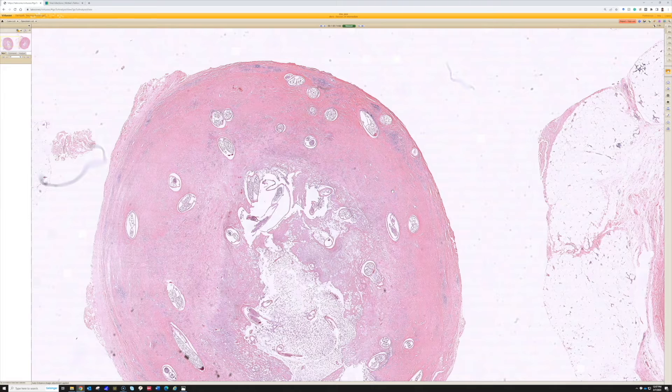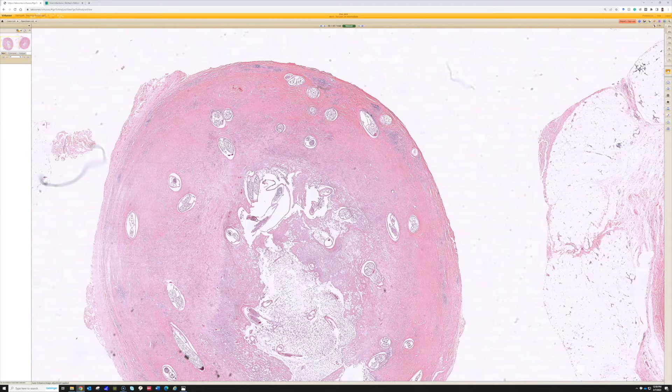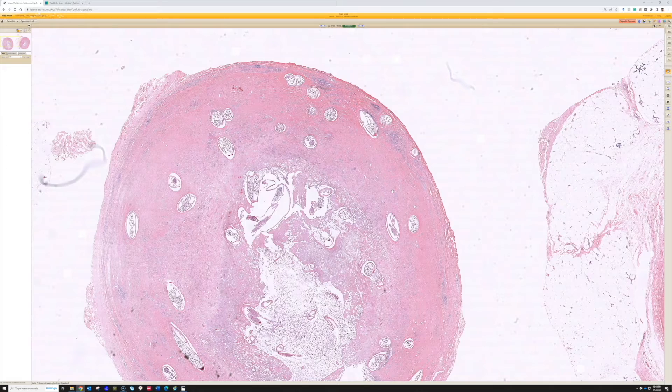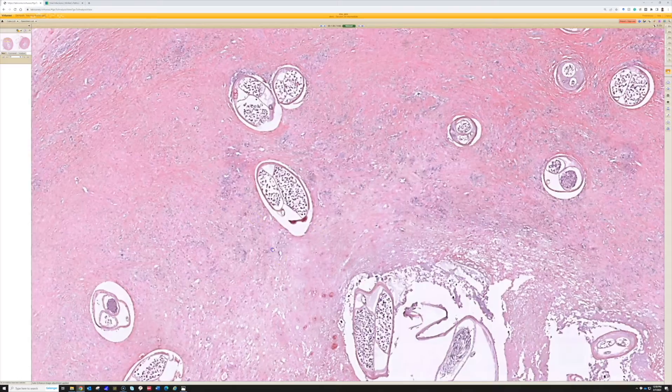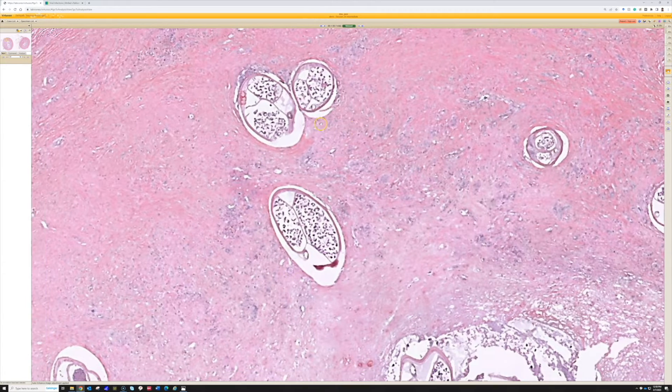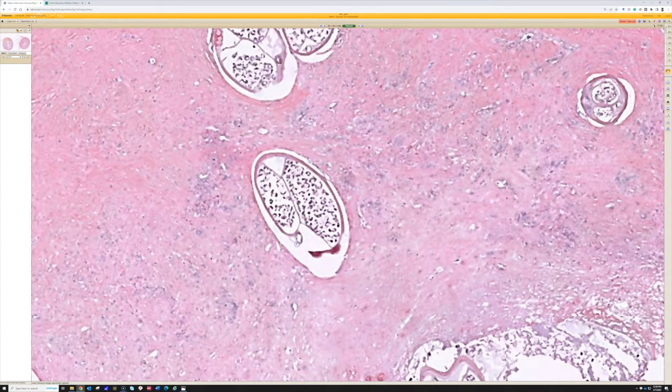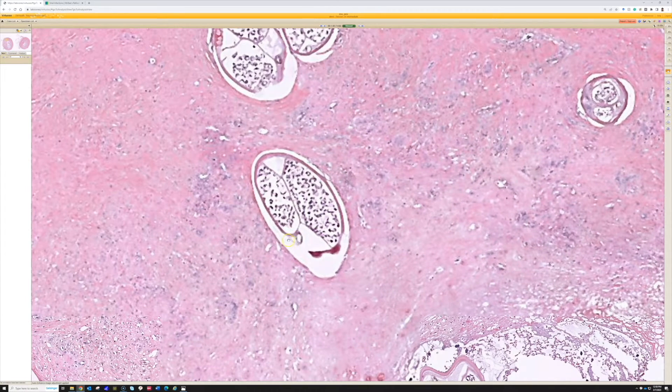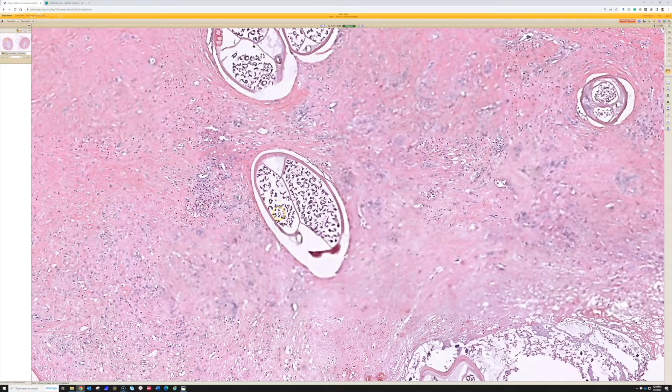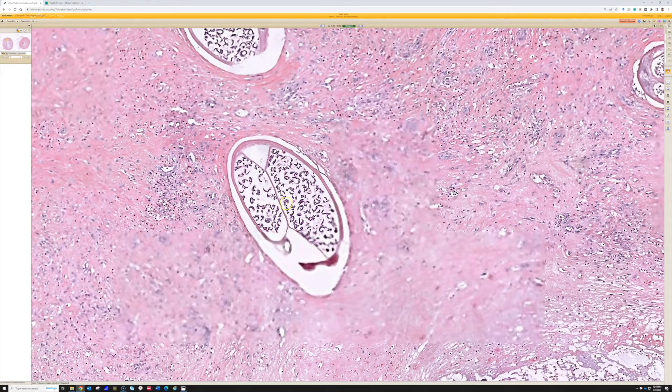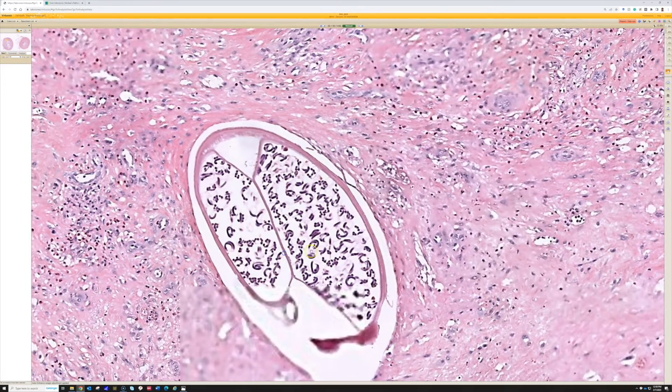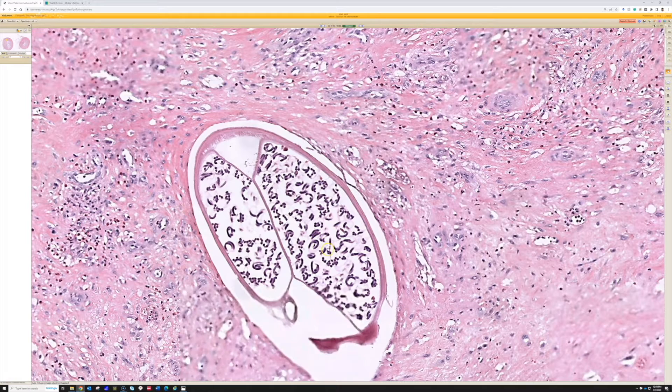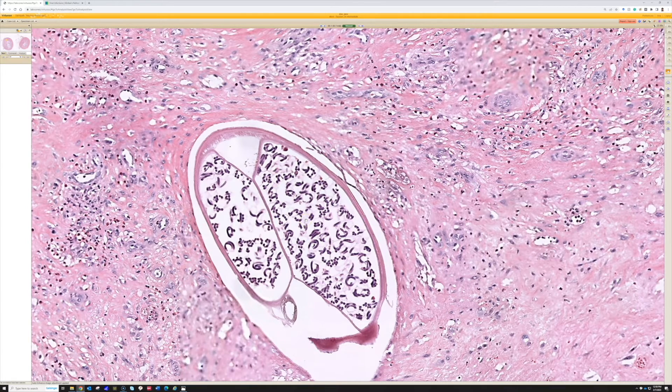So you get this scarred off nodule with some granulomatous stuff and various amounts of inflammation that is the body's attempt to wall off these worms. But what the worms are doing is mating and reproducing. And you can see that inside the cross section of this adult worm, there are many cross sections of the worm here. We have paired uteri, uteruses. One on this side, one on this side.